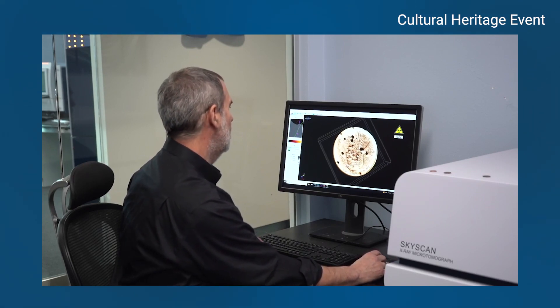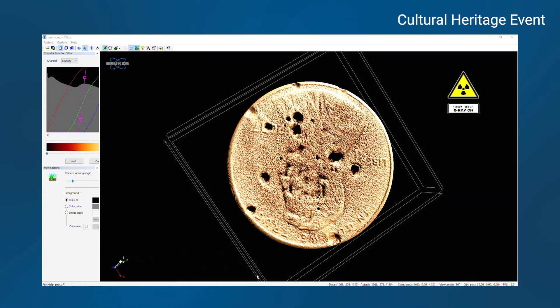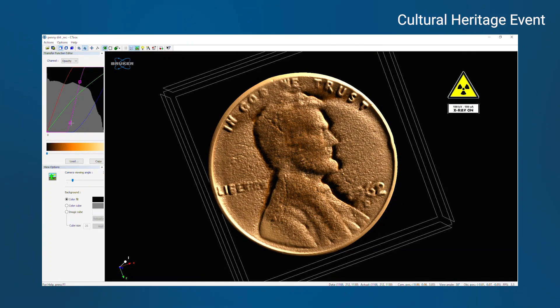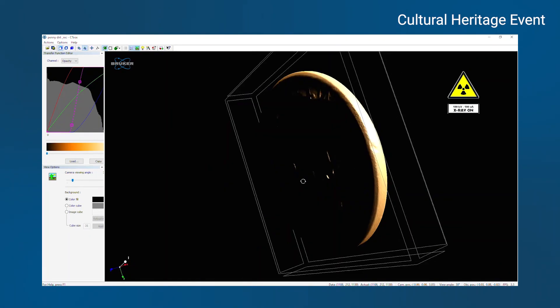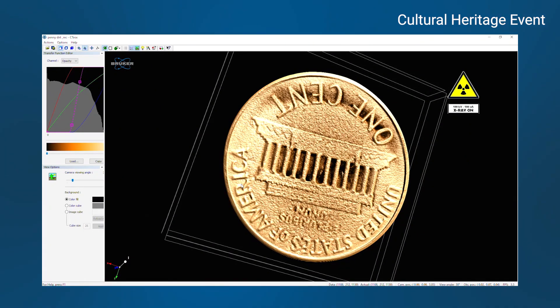The final one is the penny we have on the stage now, wrapped in muck — we couldn't see anything other than rock. Let's pull that one up, and immediately we see we have a penny in great shape. Adjusting a filter — '1962 Denver' — it's all right there. I can actually read this one a little better than some of the others because older pennies have a bit more material and are stamped a little deeper, so the words jump out much better.